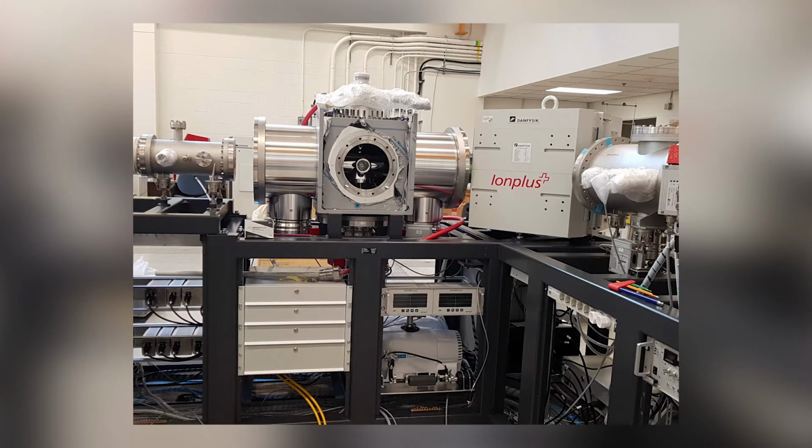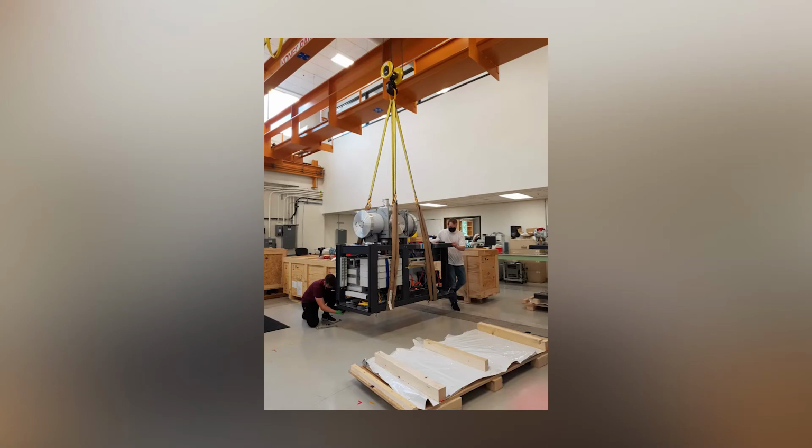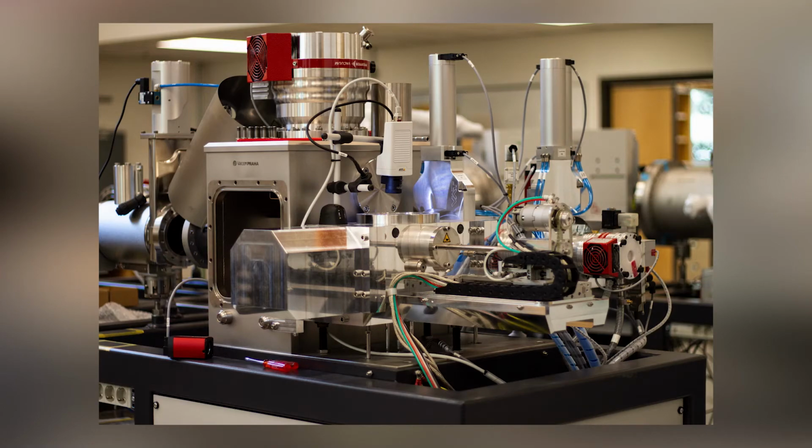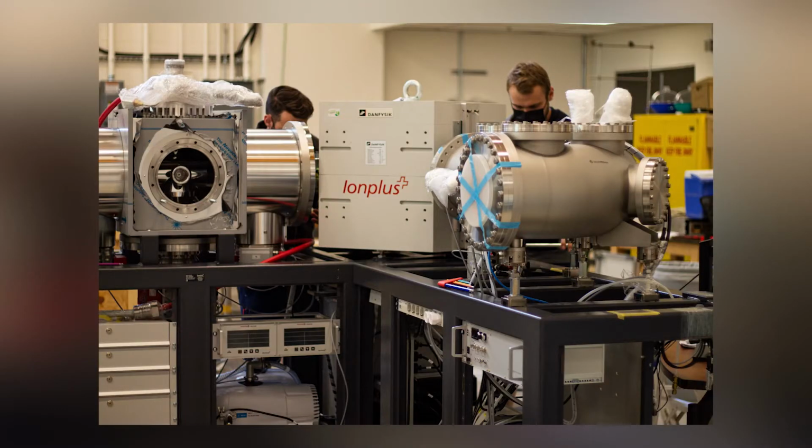The MICADAS is the top-of-the-line technology for radiocarbon dating. Ours will be one of something like 30 of them in the world currently, and the unique thing about the MICADAS is that it's tuned just for radiocarbon, and so the efficiency is very high, and that means we can date smaller and smaller samples. Currently on the big machine, we're tuned for about 1 milligram of carbon. So if you're working on a wood sample, we need to start at about 10 milligrams of sample. With the MICADAS, we can start much lower than that.